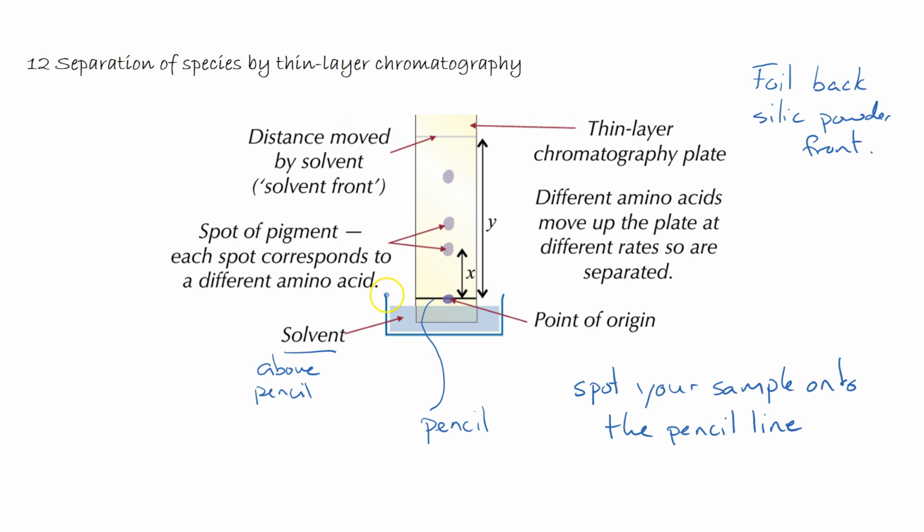Now, ideally, this picture is not drawn too well, but this is actually in a sealed vessel, and the reason we do it in a sealed vessel with a lid on is so that the solvent doesn't evaporate during the thin layer chromatography.